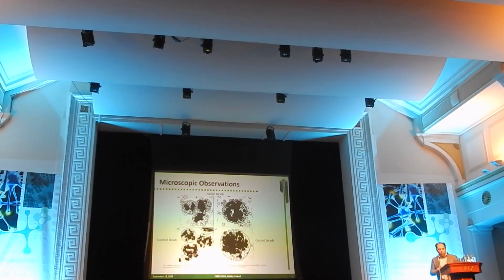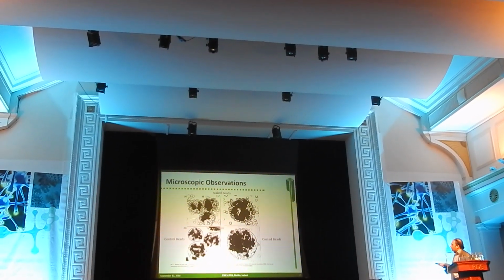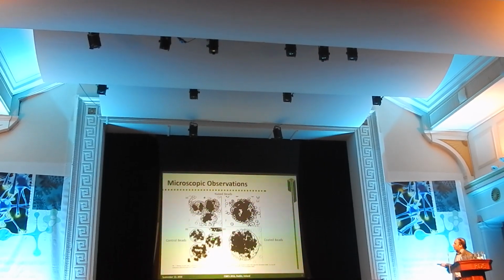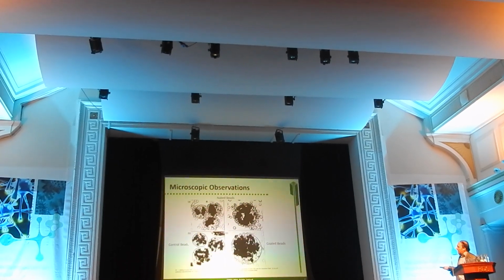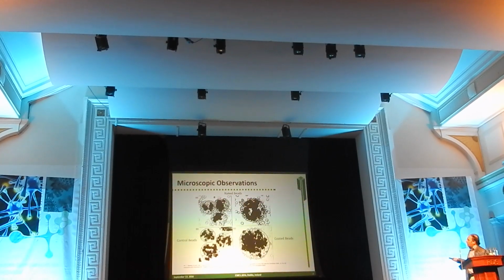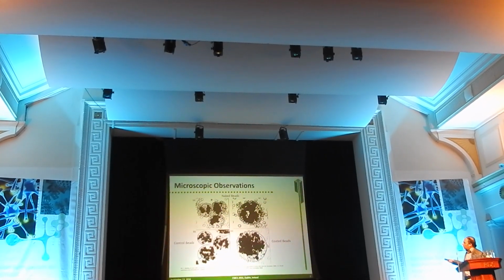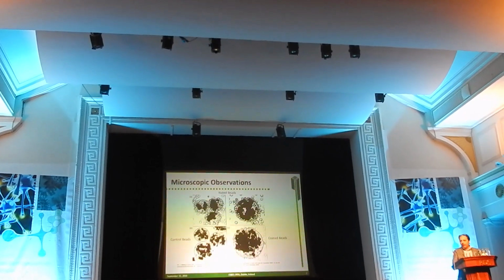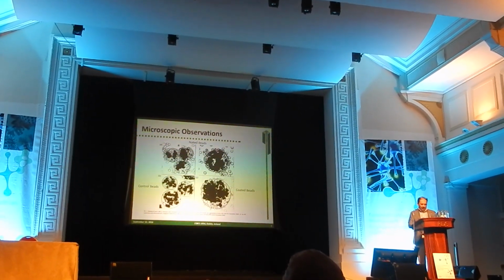Okay, so these are the systemic results here, right? But if we look microscopically, you will see under the light microscope pictures like this one, right? Control beads showing no addition of cells, for example. In this case, they are very nice, smooth surfaces, right? As soon as the interaction takes place, you see the cells binding and also clumps of these cells forming on top. So clearly, microscopically, we can actually see the phenomena happening, right?